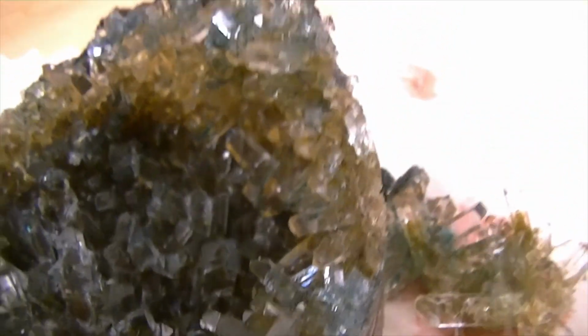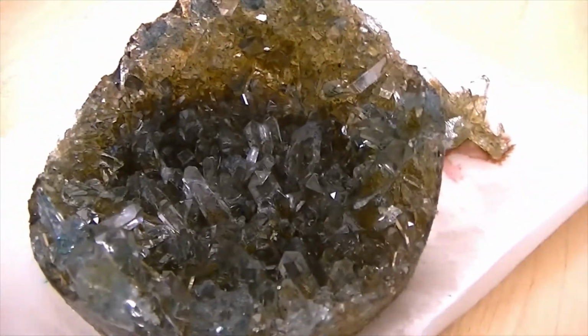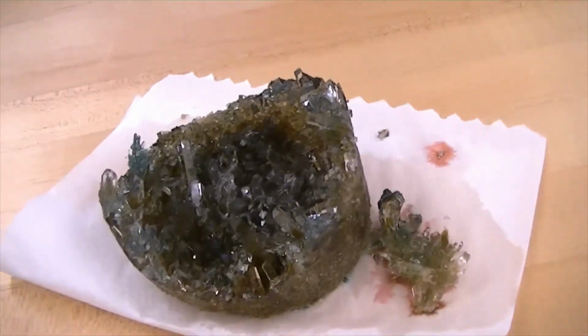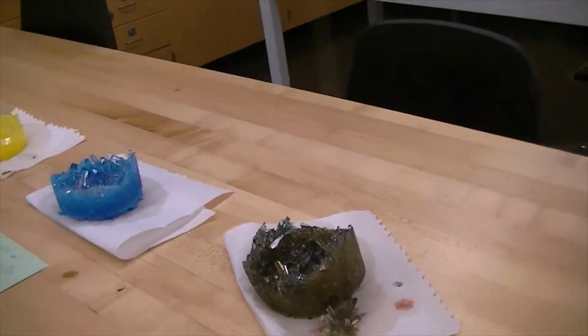The 500 milliliter, a lot of small little crystals. And some people like small little druzy crystals. I prefer the larger crystals. And that's a personal preference, and that is subject to bias, which we all have.